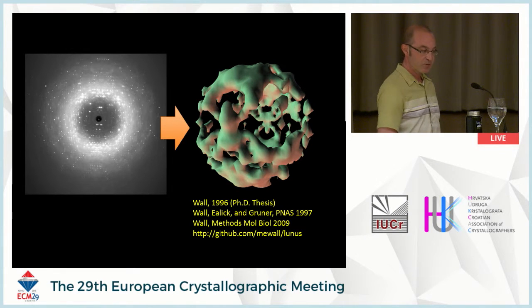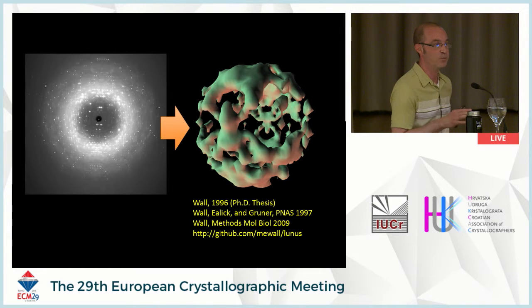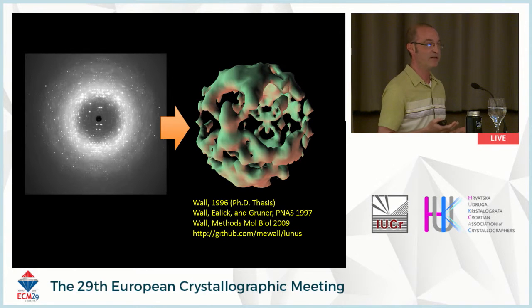So I became interested in this problem by working on the problem of diffuse scattering in staphylococcal nuclease. I developed some methods for integrating data sets that had strong enough diffuse signals to form a three-dimensional integration that's very similar to the type of integration that you do for your Bragg peaks. So this lattice that you're looking at on the right, an isosurface, is essentially the same as a Bragg lattice with some values. It's an isosurface in there.